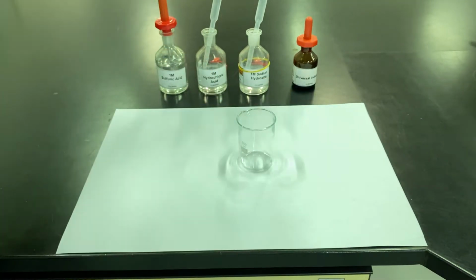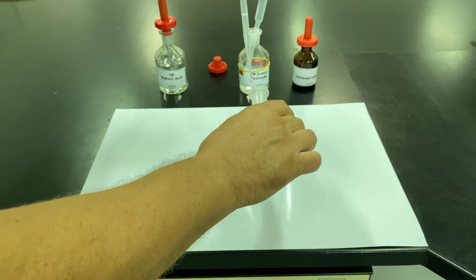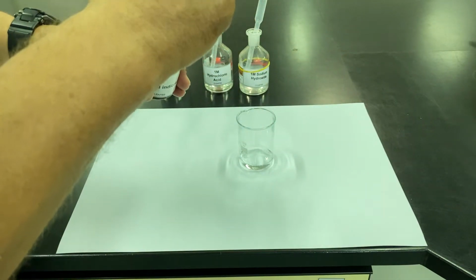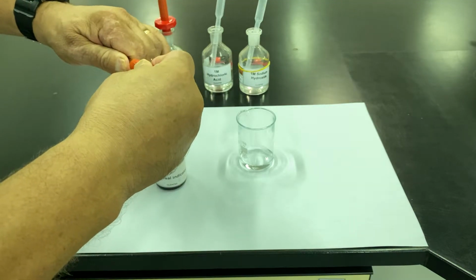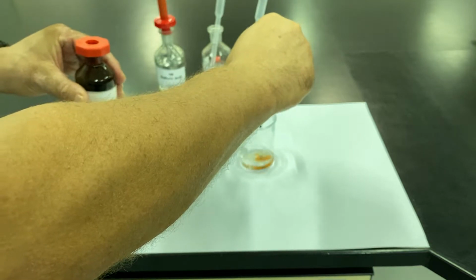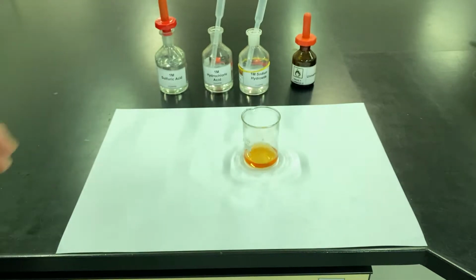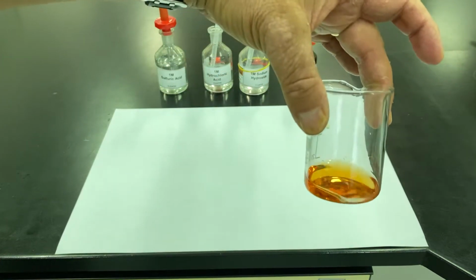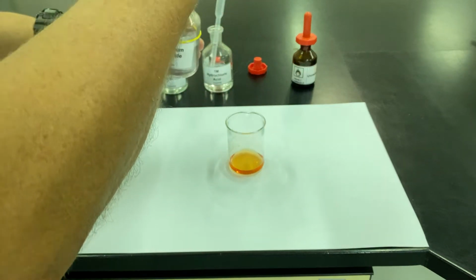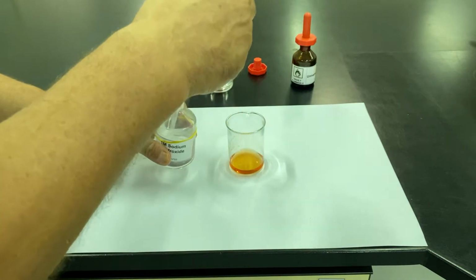Okay, so let's pour a little bit of hydrochloric acid. Right, universal indicator. What colour is this going to go? In hydrochloric acid. Right, no prizes for guessing that that's going a nice orange colour. Okay. Right, now if I slowly add the sodium hydroxide, that's going to neutralize the hydrochloric acid.